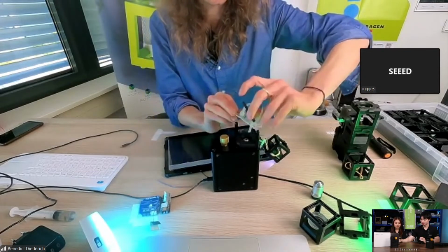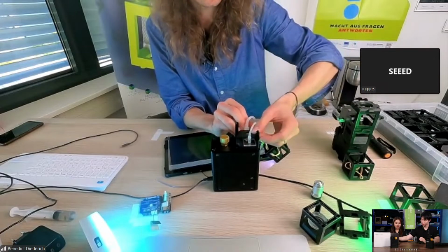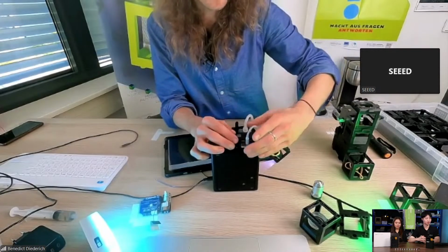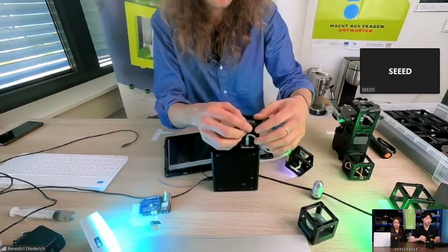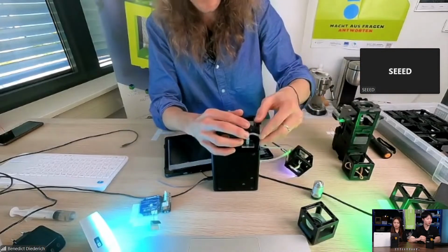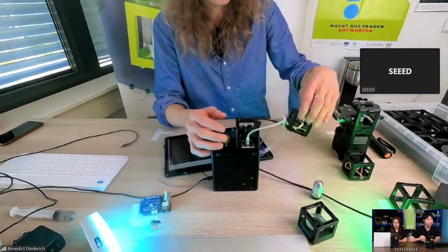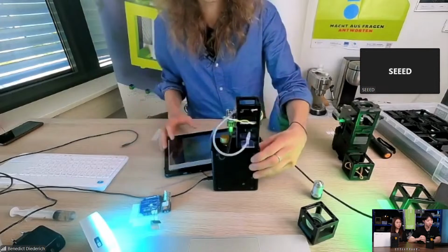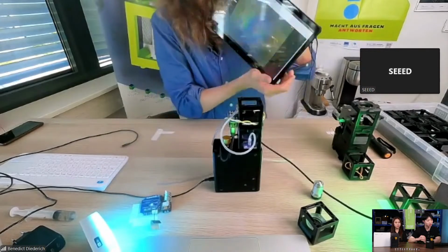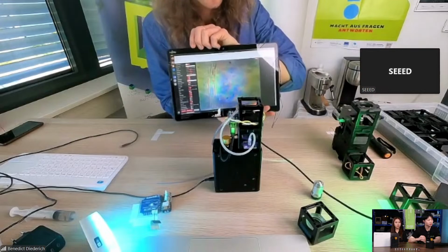And then what you can do is you can control this setup from the internet. That's actually pretty convenient. So you see how easy it can be to put stuff together. It's a bit like Lego. So now we put this here on top, and you see already the image here. It's turned on now, so we can manipulate that.